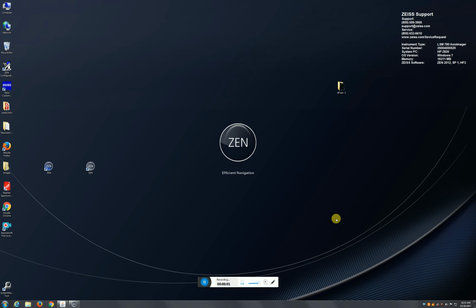Hi, this is going to be a training video about how to use Zen Black for doing confocal imaging. We're going to start off from the point where we have everything already on, but we're just at the login screen and we need to load the confocal software.